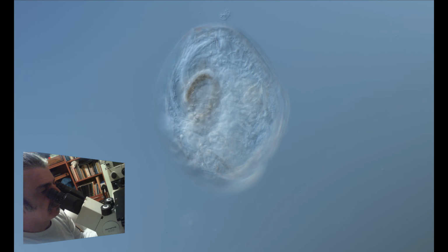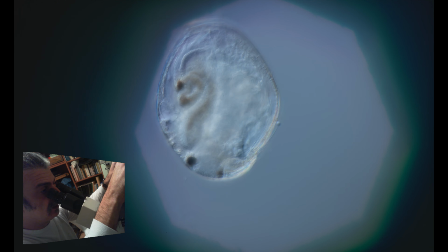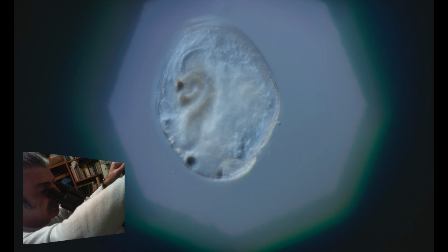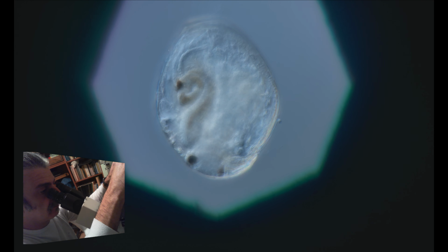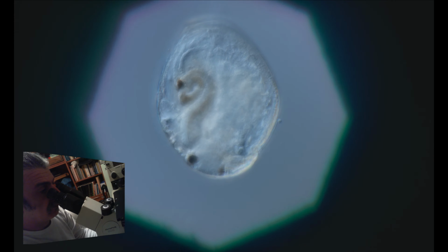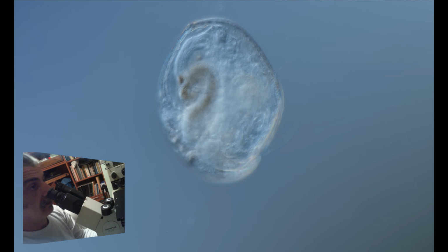It's very thick. You can see all its internal organs inside. Just let me adjust the illumination here. Let's go back to 10.